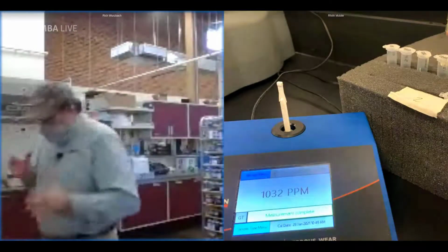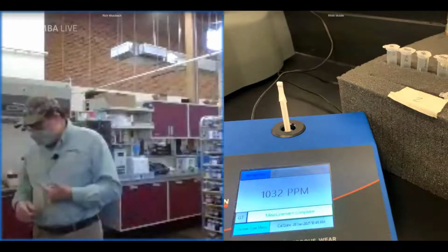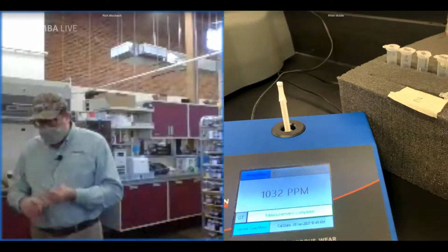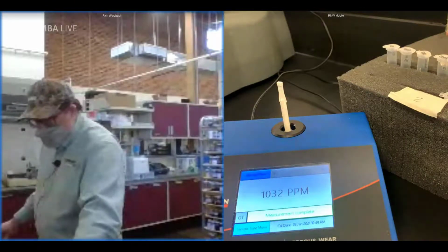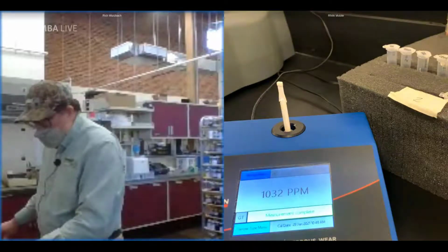So the difference in the instruments is the time involved, the ease of preparing the sample, maybe the range, whether there's a single range or two ranges. So we had a single range with the FurQ. We had two ranges with the spectra that helped us get into the higher values. We only had one range with the FDM, so we kind of cut off there.